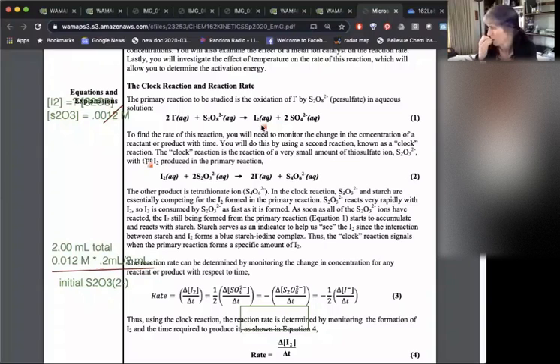So we would have been adding all of these species into the well plate except for the persulfate, the S2O8. Yes, and then adding that. Yeah. Okay, I see. It's kind of strange to picture all this. Yeah. So we put these things in on one side and this in at the time that we start.